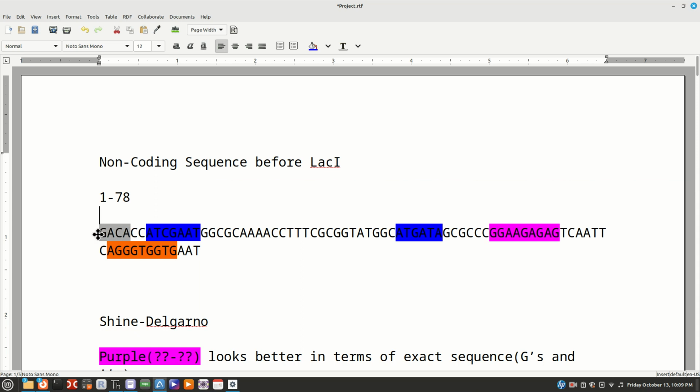GACA right there. I wonder what two letters come before that. I wonder if those are TTs. Now, if we had a little bit more sequence here and there were two T's here, oh man, we found it. But we don't. And I don't see any GACA anywhere near, but there's a GACA. You can make an argument that maybe there are two T's before this one, and that's the correct one. You could also make the argument that maybe the end of this blue piece, here's a CA, but we'd need a GA. Yeah, it's hard to say.